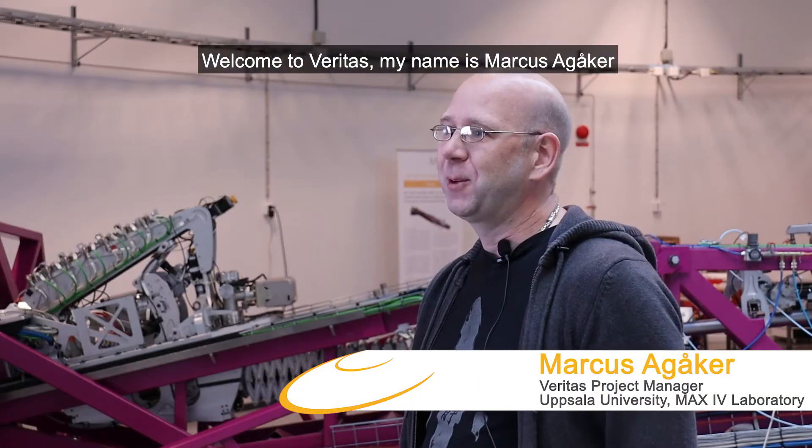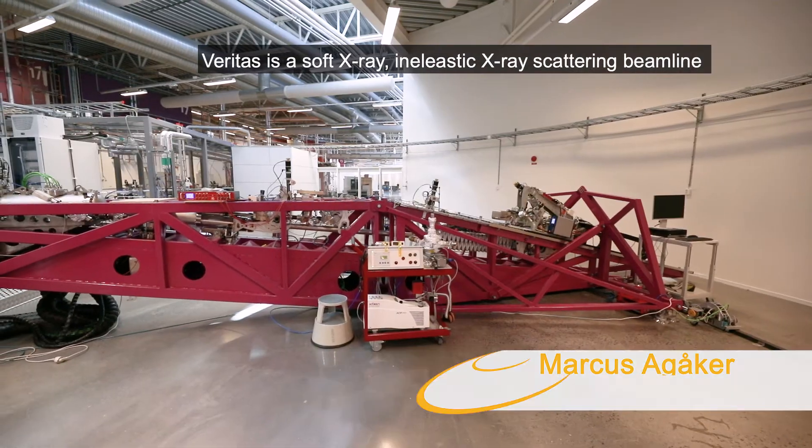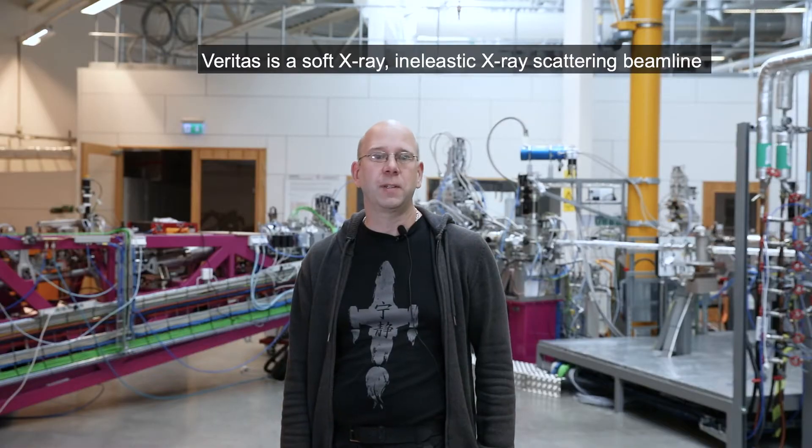Welcome to Veritas. My name is Markus Agoker. I am the project manager of Veritas. Veritas is a soft X-ray inelastic X-ray scattering beamline.